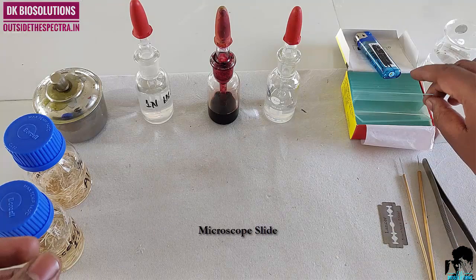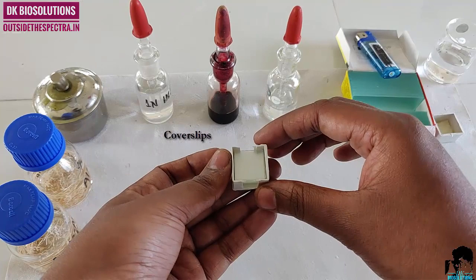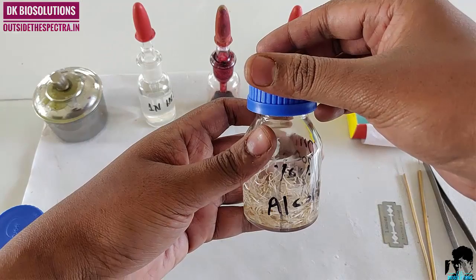We clean microscope slides and cover slips. Lighter. Water to clean roots. Now we will start with our practical part.